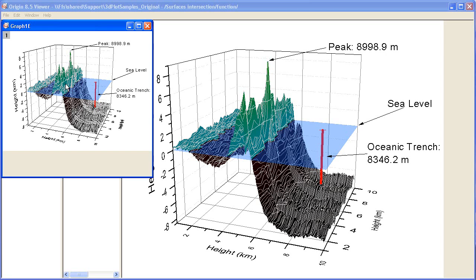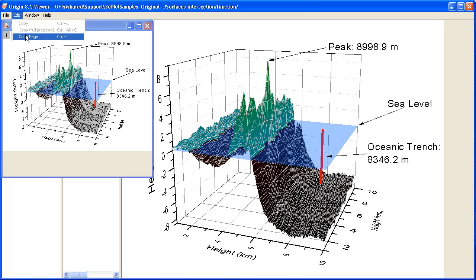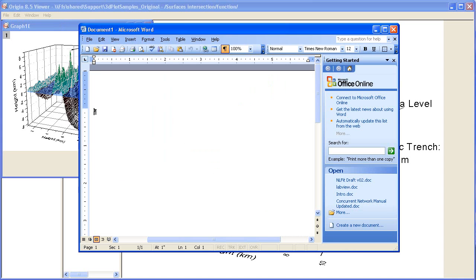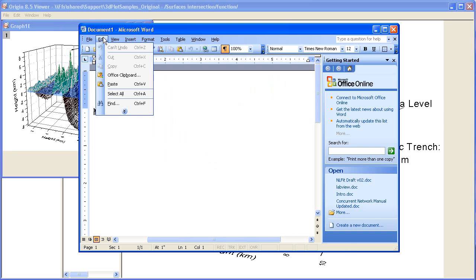Graph windows can additionally be copied from the viewer by going to Edit, Copy Page, or using Control-J, and this allows them to be pasted into external applications such as Microsoft Word and Microsoft PowerPoint.